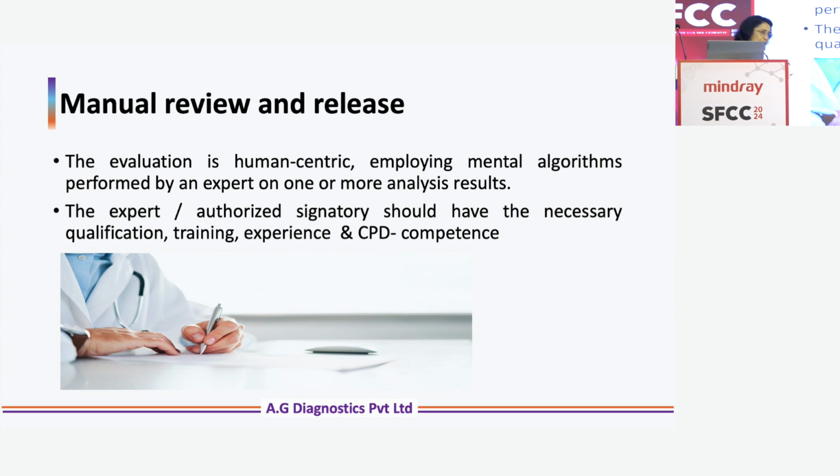Traditionally, the authorized signatory does this, may it be the senior technical person, the MD biochemist, pathologist, microbiologist, whoever is the authorized signatory and has the necessary qualification, training, experience, and continual professional development. So the competence. What does this person do? This person employs mental algorithms in his or her own head. Which patient is this? What value am I looking at? Is it a critical result? Do the pre-analytics seem okay? After all this mental math, that person will decide whether to release the report or not.